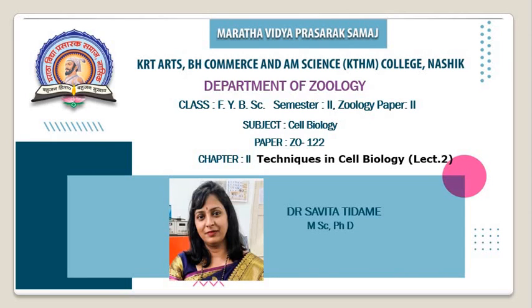I welcome you all to the online lecture, and today we'll be studying chapter number 2, that is Techniques in Cell Biology. Under this chapter, we have completed the simple microscope as well as the compound microscope, and now today we'll study the electron microscope.